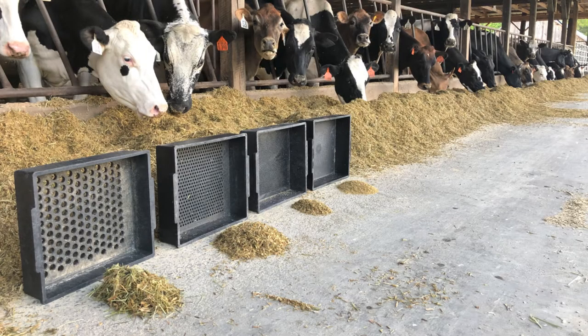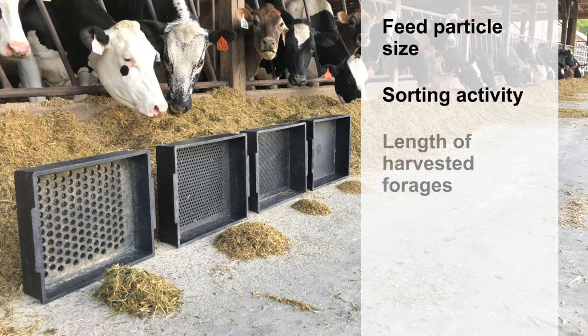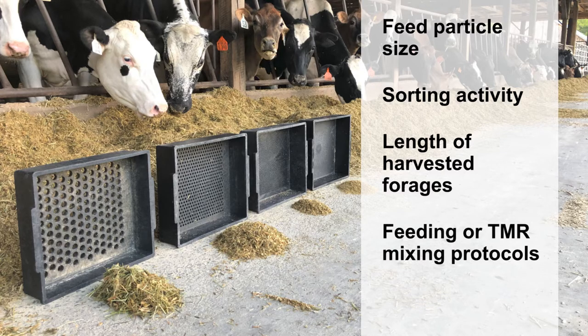The Penn State Particle Size Separator, or PSPS, is an effective tool that can be used to evaluate feed particle size, sorting activity, length of harvested forages, and feeding or total mixed ration mixing protocols.